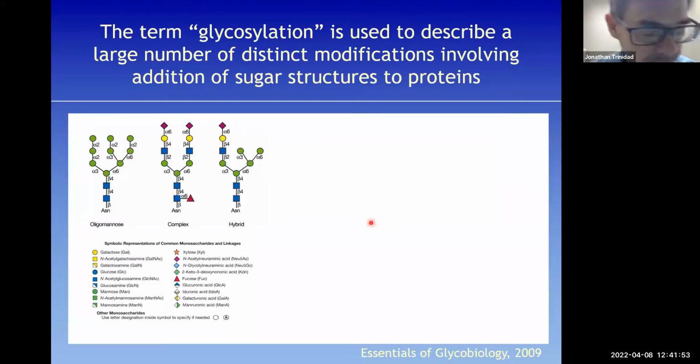All right, so moving on to some glycosylation. Glycosylation, we could talk for hundreds of hours about glycosylations. But very quickly, right, there's essentially, depending how you count, 3 types of glycosylation. This is an example of N-linked glycosylation. In this case, the N refers to nitrogen on asparagine residues. So these types of structures get put on asparagines on extracellular or secreted proteins.